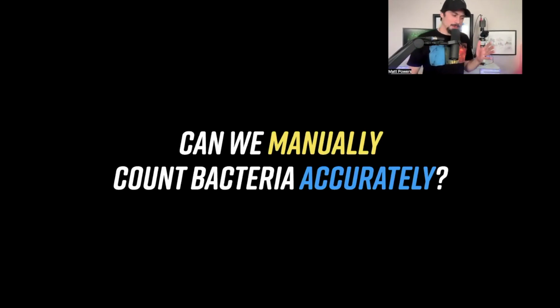So, this is a question that people often struggle with. Can you manually count bacteria accurately? Now, there's always the question of do you need glasses? Because someone who needs glasses versus someone who doesn't with really good vision, the person with better vision is going to see more, right? It is also the case that when some of these microscopy folk go to a party and go out at night and they drink, they'll come back the next day and won't be able to see the bacteria because their vision is blurry. So we can have lifestyle choices that actually affect our ability to see these things.